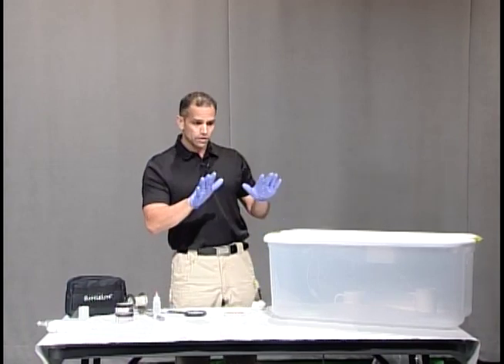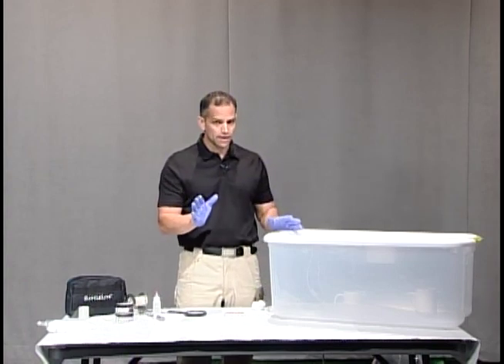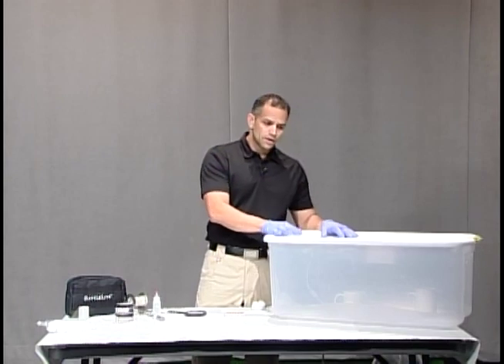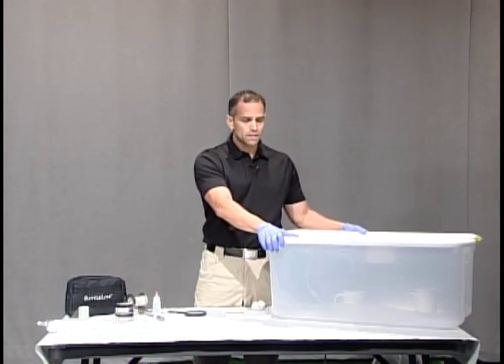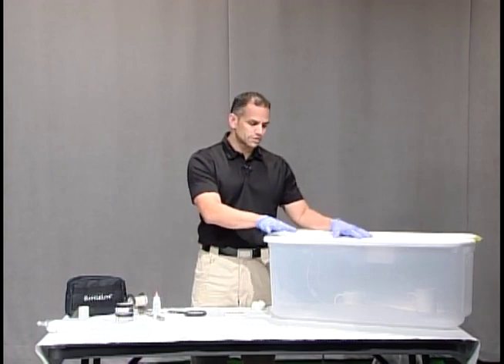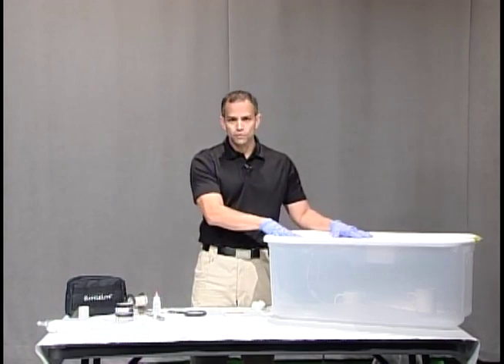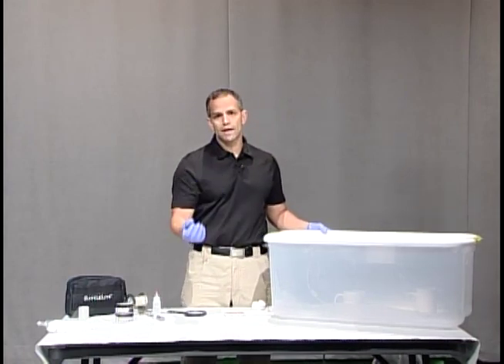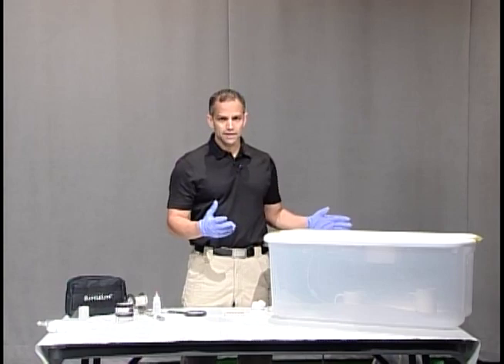If you over fume, the ridges of your fingerprint are going to run together and you're not going to get a good print. The other thing that's important to remember is this is a portable chamber — there's no fuming hood in here. If you're at a crime scene you have to remember that there are super glue fumes in here and they can be harmful to you. So when you open this you would need to do that outside or in a well-ventilated area.